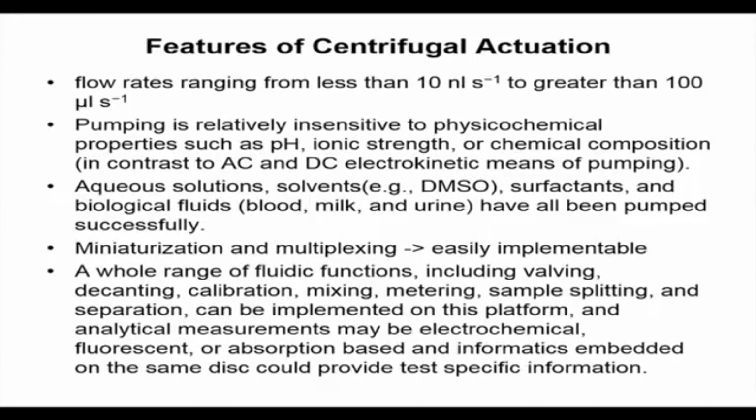A whole range of fluidic functions including valving, decanting, calibration, mixing, metering, sample splitting, and separation can be implemented on this same platform. So it is just like another form of lab on a chip. Instead of the chip you have the CD, and analytical measurements may be electrochemical, fluorescent or absorption based, and informatics embedded on the same disk could provide test specific information.